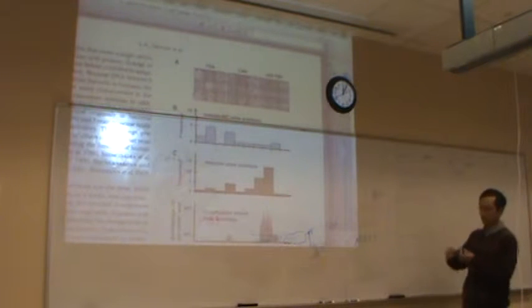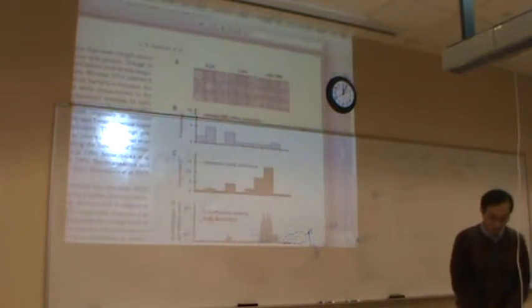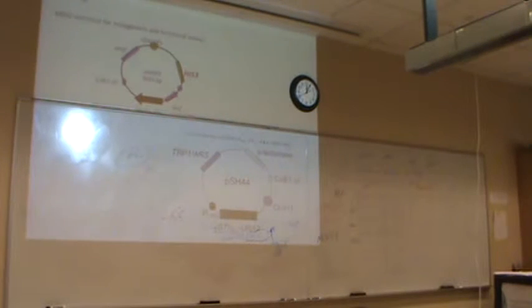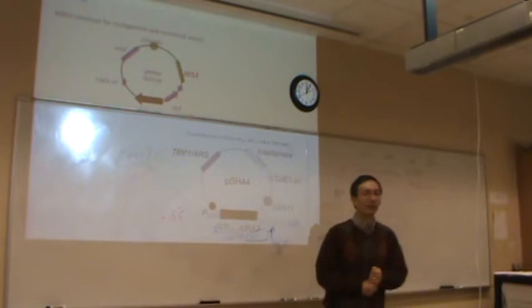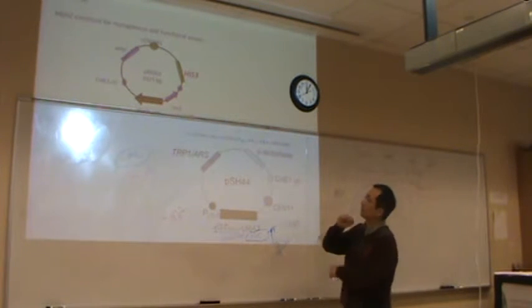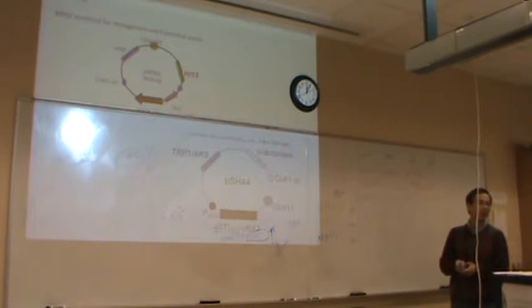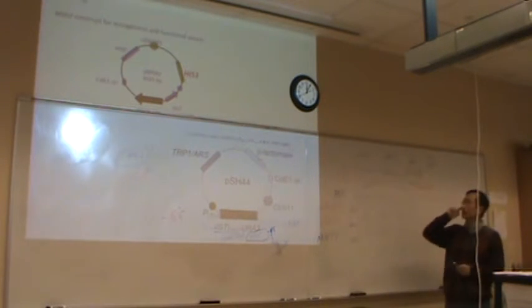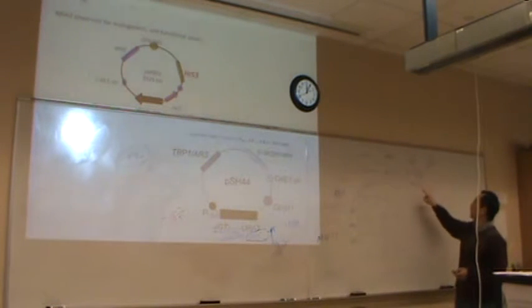Let me recall this again. At least leave a voice record there. So the media recipe for the FOA assay is minus tryptophan, minus histidine, minus leucine, plus FOA.